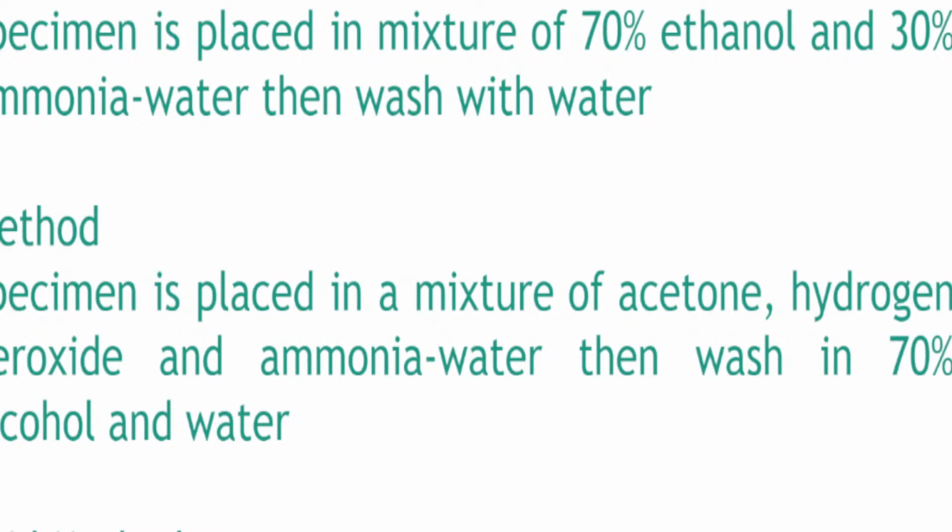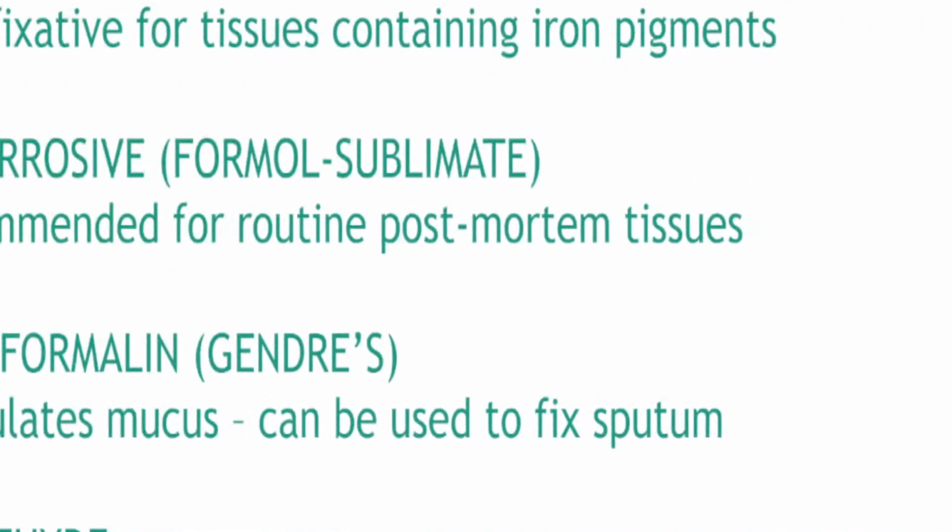Then we wash it with 70% alcohol. Usually it's ethanol still with water. Okay? And then picric acid method is the most dangerous of them all kasi if picric acid dries out, it becomes explosive, which is a safety question for the ASCP, by the way, if you're taking the ASCP board certification exams. Okay, next.